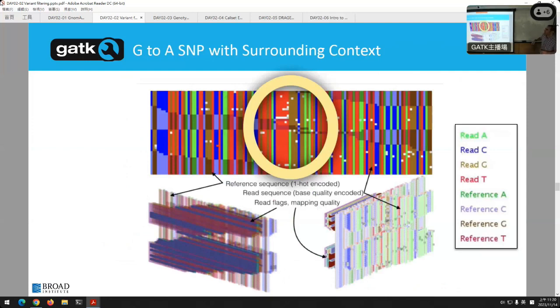And what we found here, I know this looks pretty clear, right? You can see the SNP. Everyone can see the SNP? Yeah? I hope no one's saying yes, because it doesn't make it. Okay. So this is actually a three-dimensional channel that you're seeing here of a SNP that it has learned inside the data. So what am I looking at here? So it's a G to A. So G in IGV, we've used the same colors as IGV. G is brown and A is green.